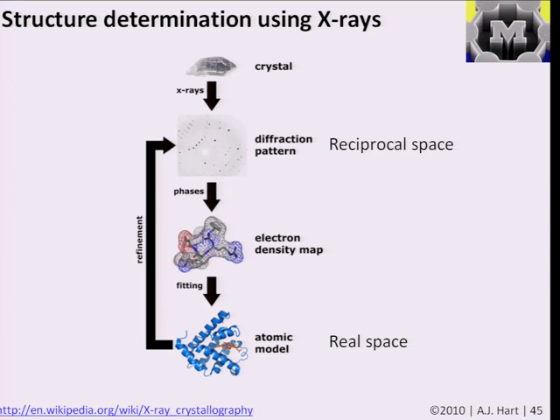But the general idea is that because it can be mathematically determined how a beam of X-rays or a beam of electrons interacts when the atoms in a material are in certain places, then we can take a diffraction pattern or a scattering pattern of a sample, and then we can do some math on it to calculate what organization of atoms we actually have.